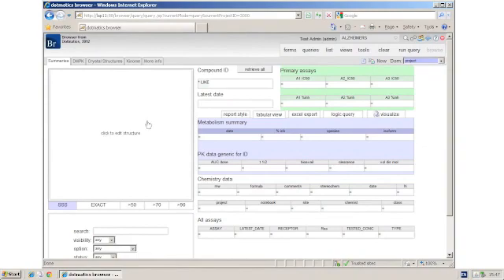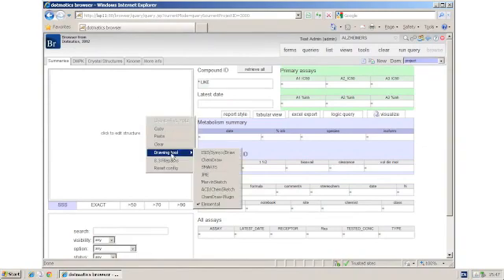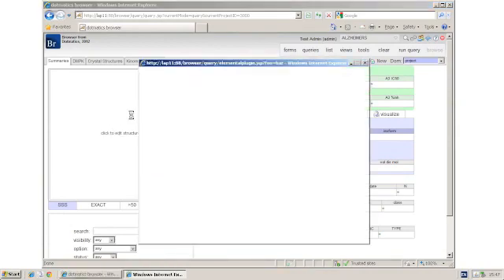The big one on the left is a substructure search box. I can choose from any of the drawing tools that are available or use the built-in drawing tool, Elemental.